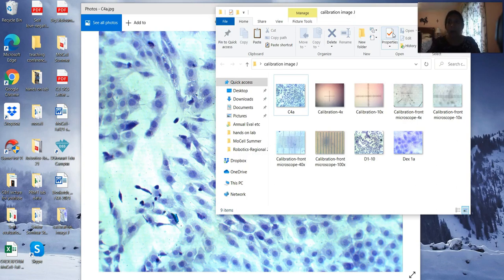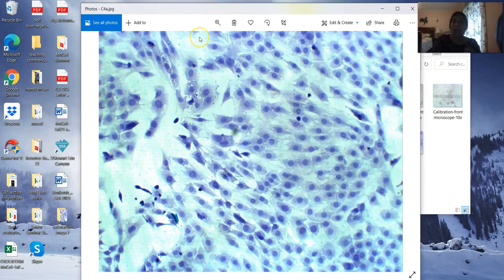We have talked about how we use that to calibrate our actual physical microscopes before. Now, in this case, we don't have an actual physical microscope, and each microscope that we may use is going to have different calibration of its ocular micrometer. So we need to make sure that we have images of the stage micrometer, of that slide ruler, at the same magnification as the image that you want to analyze, as well as using the same microscope.